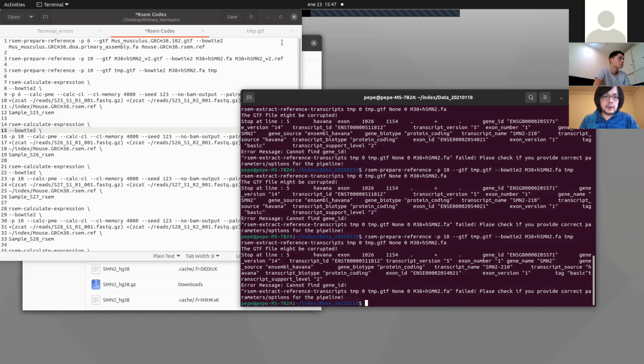I'm trying to think about what I did, trying to find my previous script for doing this. We can revisit this next week, and we can do the gene expression analysis of the samples that ran against the mouse genome. I will send you the script or instructions later for fixing this issue.